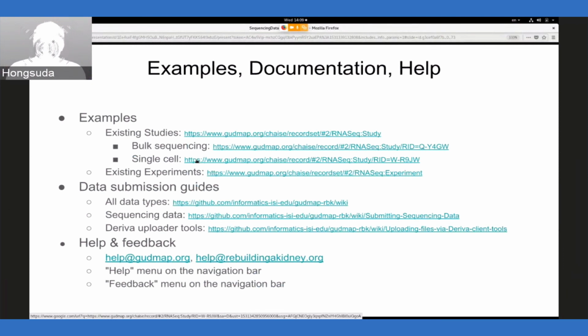And if you need any help, just feel free to talk to us anytime. If you want to include your data in any publication journals, for example, we're working with Doug's lab right now to help them put together a collection, and then we'll guide you through the whole process of data citation and everything.